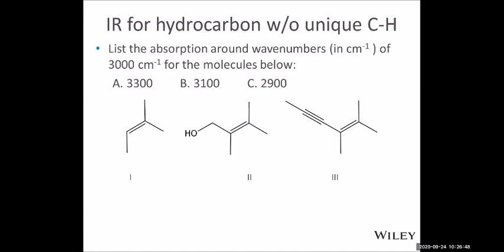And so these are the little practice on what to expect with the given molecular structures. So this is the alkyne. If there's an alkyne and the alkyne has a hydrogen attached to the triple bond of carbon, then you would have 3300 wave number absorbance.